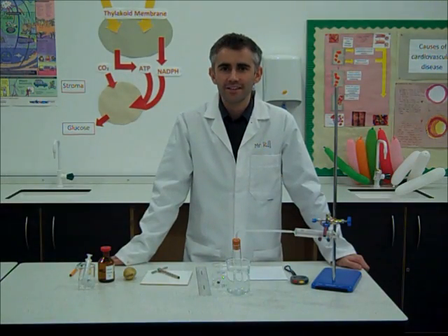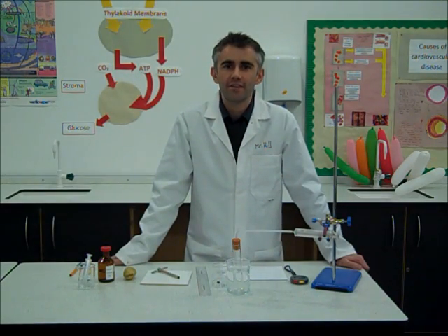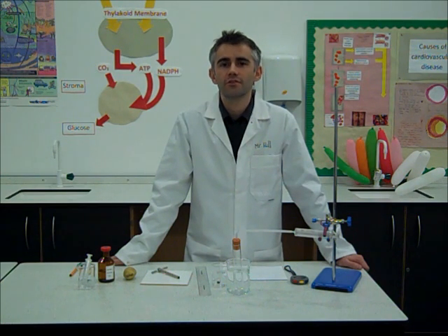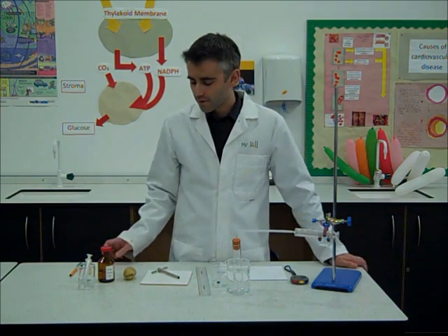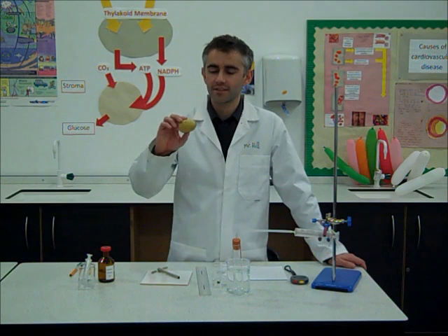In this experiment I'm going to show you how to investigate the effect of enzyme concentration on the rate of an enzyme controlled reaction. The enzyme we're going to be using is catalase and you can find it in potato.